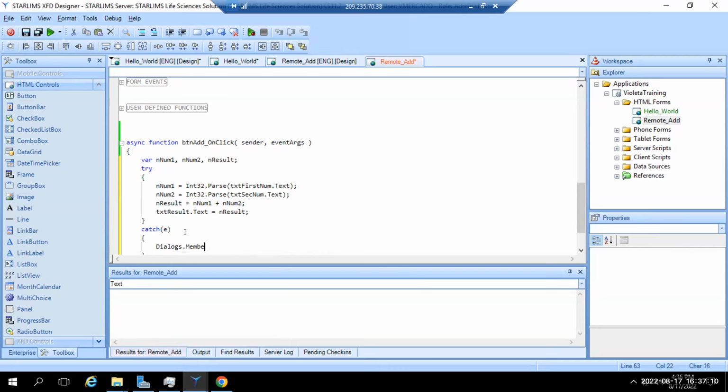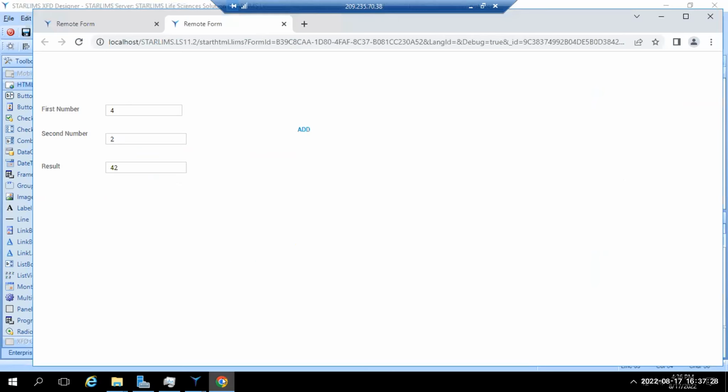Whoops. All right, so hopefully that works. Hopefully we get a 12. I mean, not 12. Whatever our values are. Oh, I need to refresh.